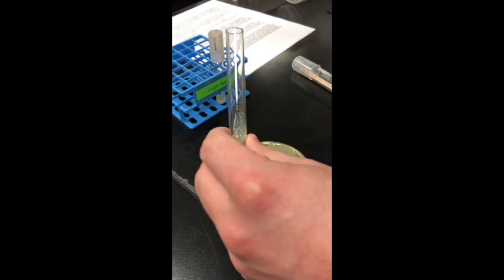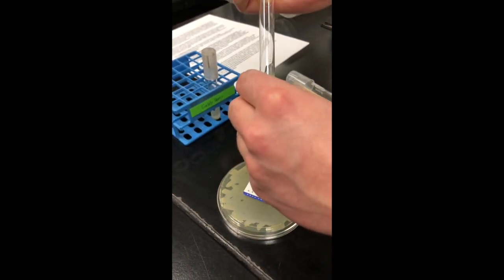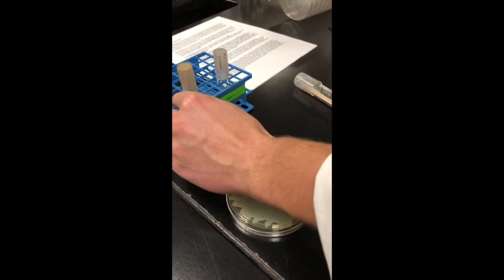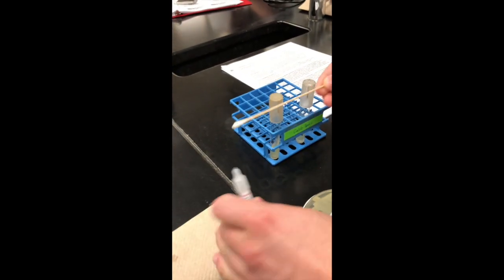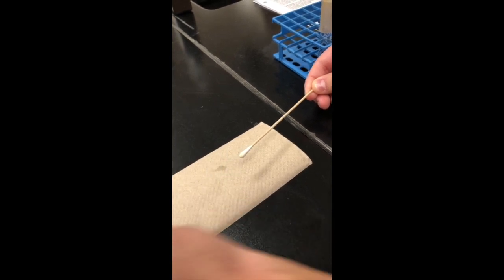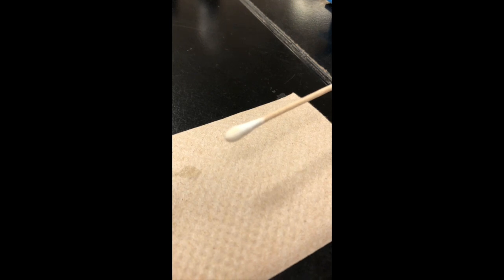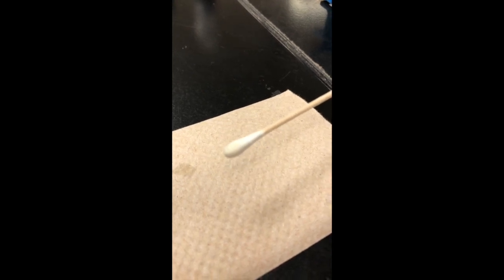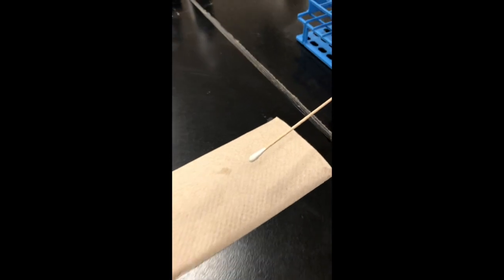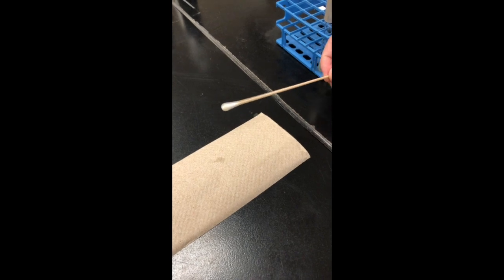And so we're going to start with E. coli. We're going to get a small amount of bacteria on our cotton swab, and then we're going to add our drop of oxidase reagent, and wait about 10 seconds and see if we get a color change. I'm not seeing a color change for E. coli, so that means we don't have cytochrome C.